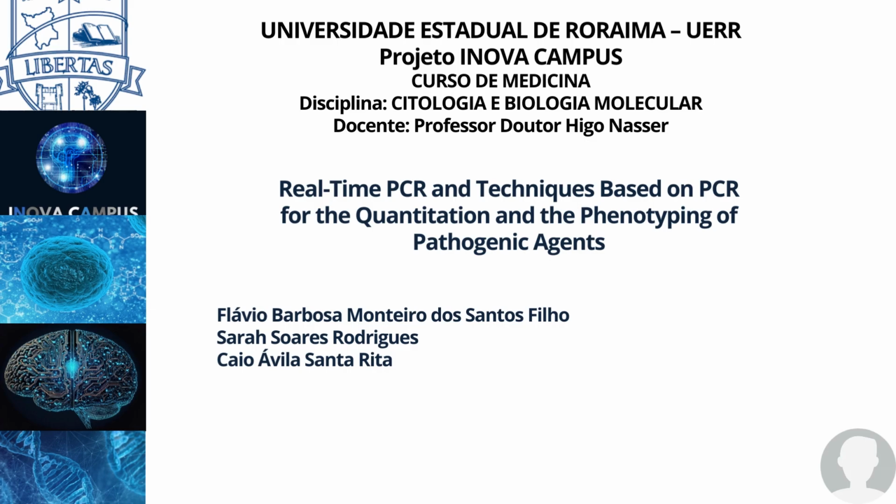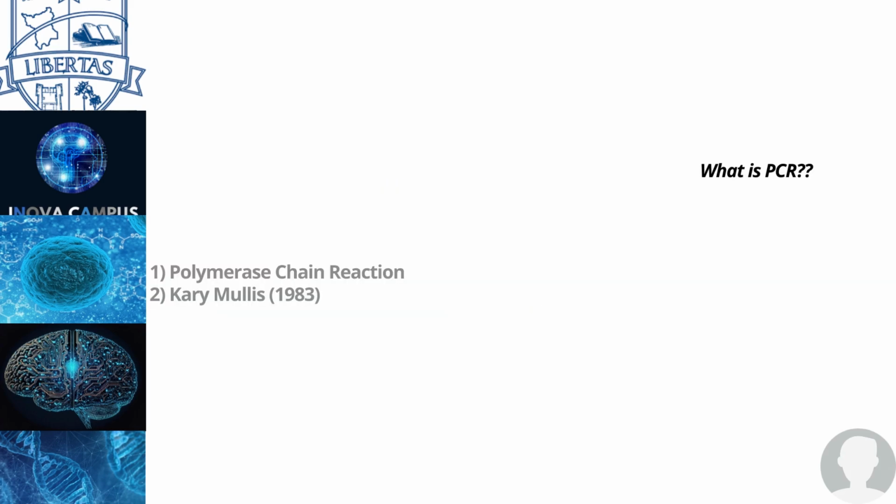So the first question that we have is what is PCR? PCR is short for polymerase chain reaction, and it is a technique, a molecular test invented by Kary Mullis in 1983. What he wanted to do was use a primer to produce many copies of a DNA strand.